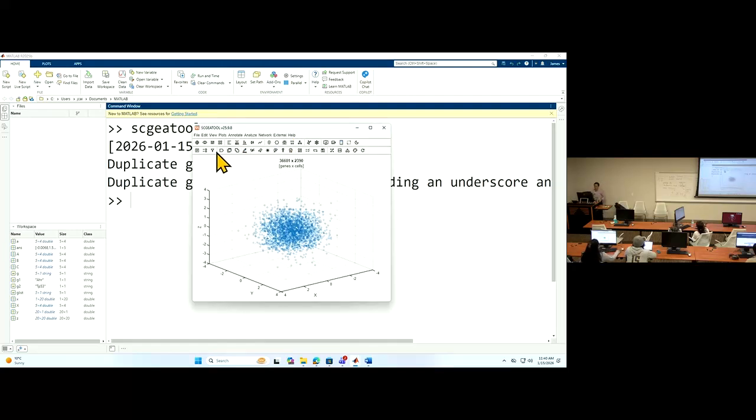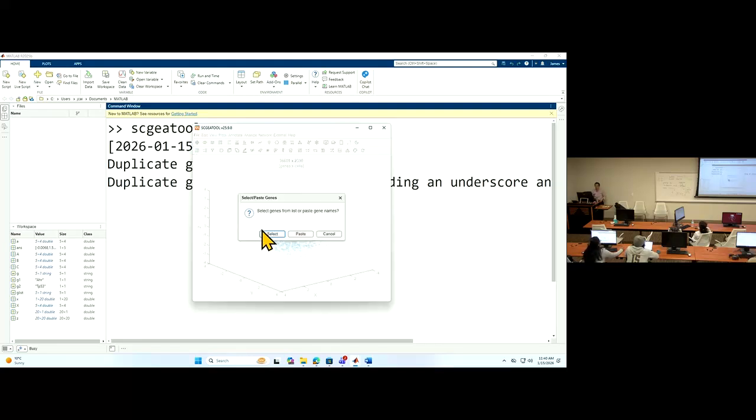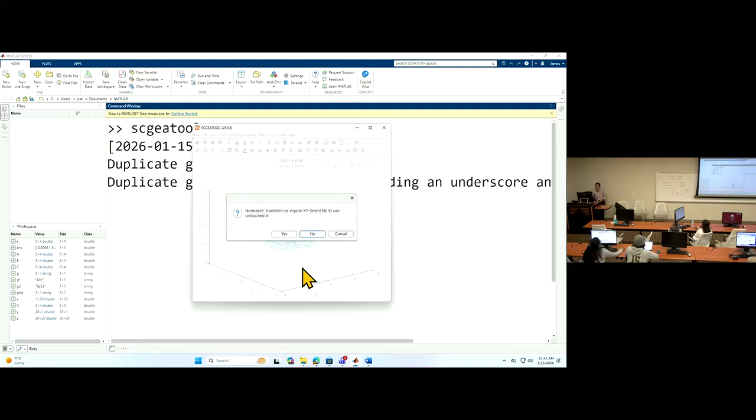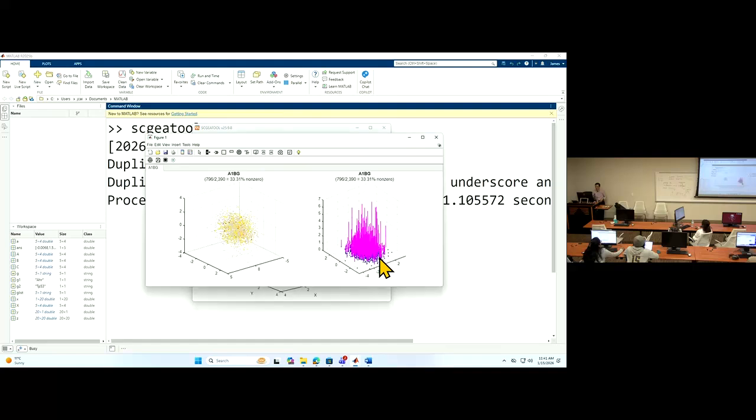So for the next, you will check the first button, which is in the second row here. Here you will have a list of genes. You can select to look at, okay, those are the genes. The gene names, not complete. You will be able to see the expression level of some genes in those cells. Okay, so this is a very basic exploration tool. You select one of the genes and look at their expression among these cells.